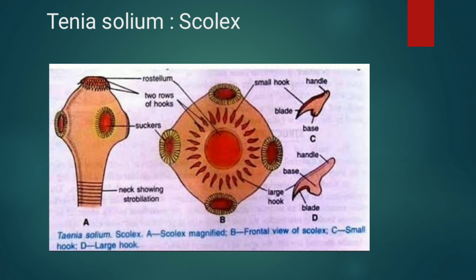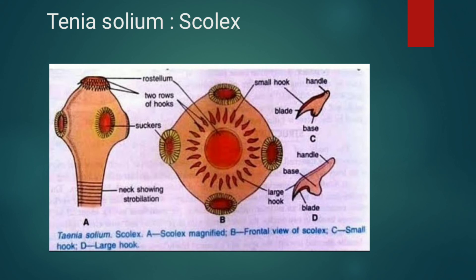Now we see the scolex of Taenia solium. The scolex is the cephalic portion of the body; it is knob-like, smaller than the head of a pin, measuring about 1 mm in diameter. It is the organ of attachment and also contains the nerve ring and nephridial canals. It is roughly quadrate in structure and has two distinct parts: proximal and distal.